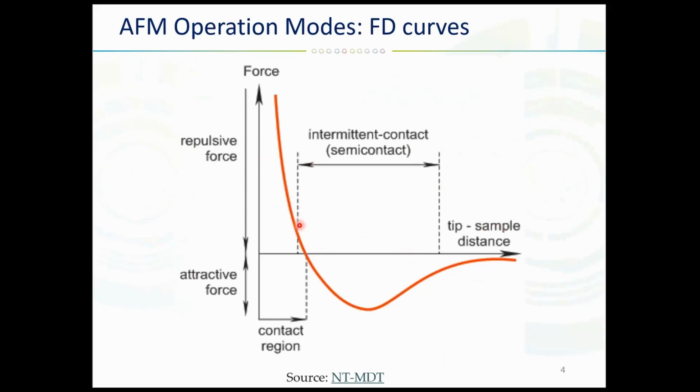You can see in this figure that the atoms are separated by a large distance on the right-hand side. Once you bring atoms closer to each other, let's say a few angstroms apart, they start to be attracted to each other. And this attraction increases until they come so close together that the electrons begin to keep away from each other electrostatically. So this will be a repulsive electrostatic force.